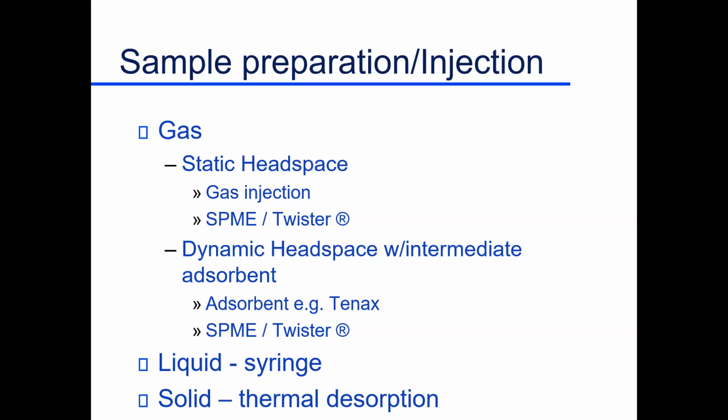Another way that we use again in the laboratory is a dynamic headspace. So we've got our container, got our sample there.